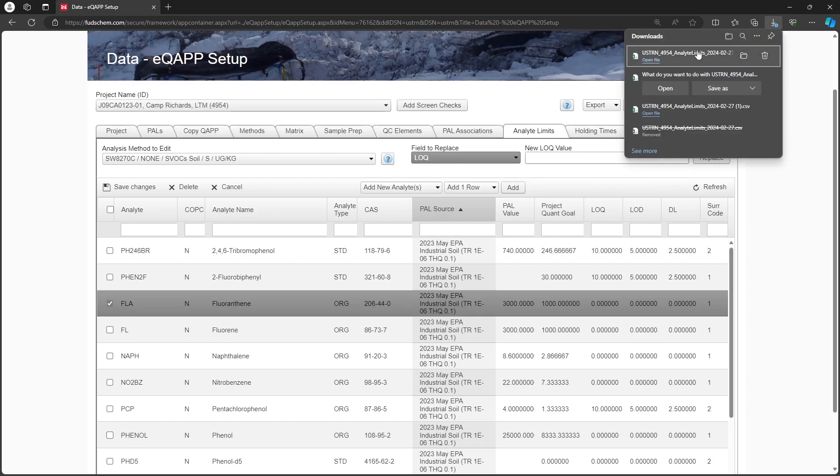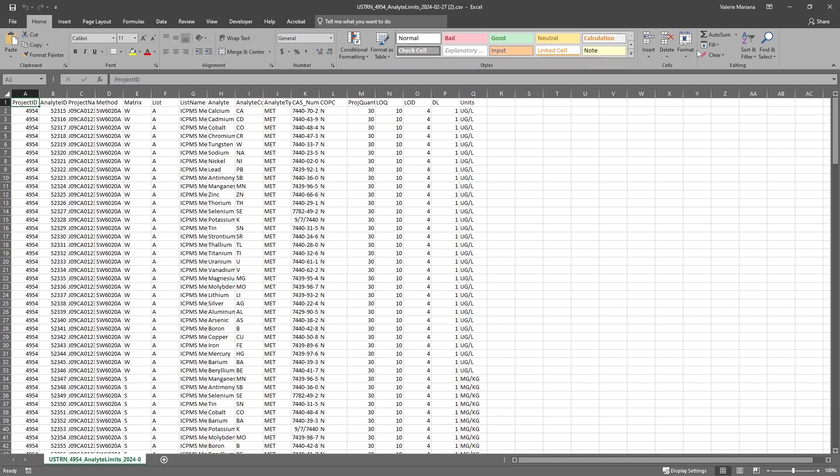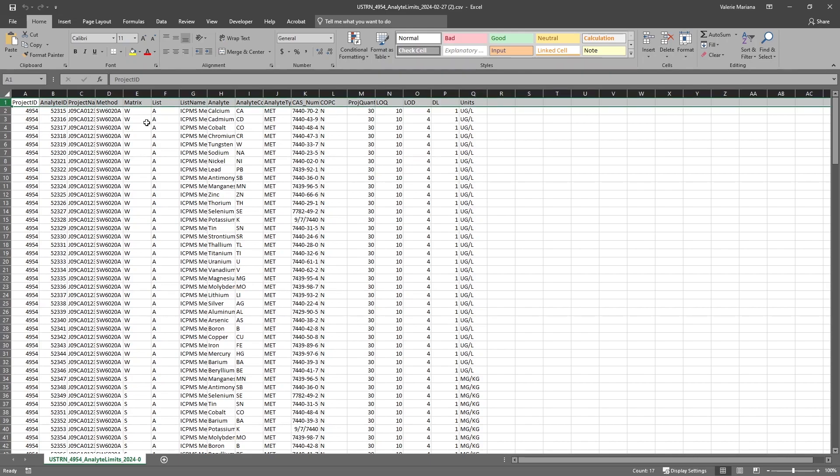Open the CSV file. All Analytes for all methods for the project will be listed, and can be edited here all at once. You can sort the rows and filter without affecting the reimport.